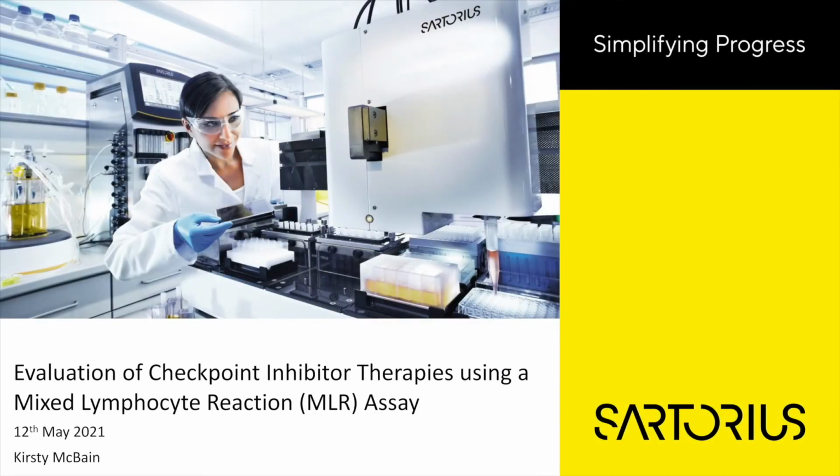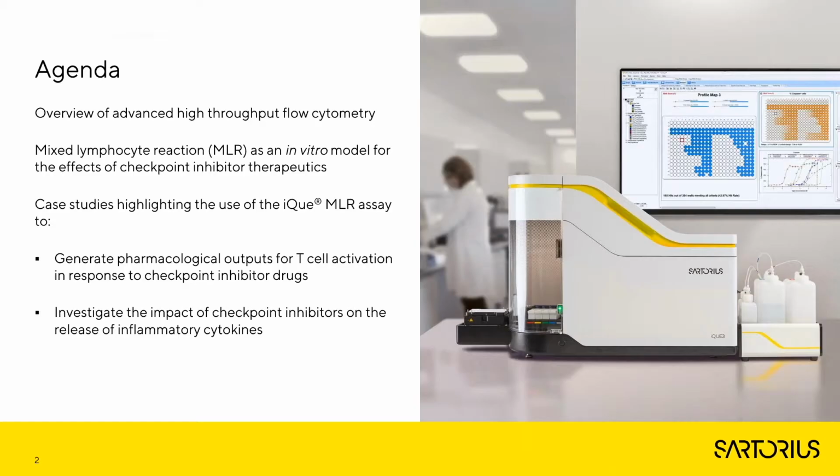Today I'm going to be presenting this webinar focused primarily on investigating the effects of checkpoint inhibitor drugs, titled Evaluation of Checkpoint Inhibitor Therapies using a Mixed Lymphocyte Reaction Assay. So first on the agenda is a general overview of some of the uses of advanced high-throughput flow cytometry in biological applications. Then I'm going to give some more detail on the iQue3 platform, which is the advanced flow cytometer that was used to create the data displayed in this webinar.